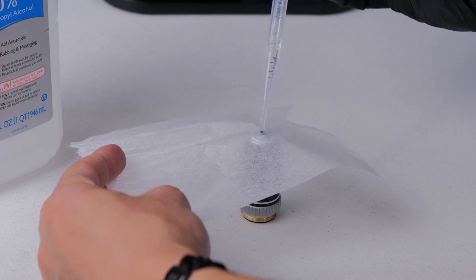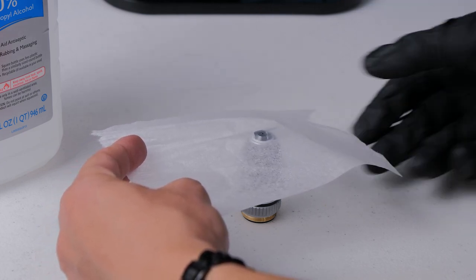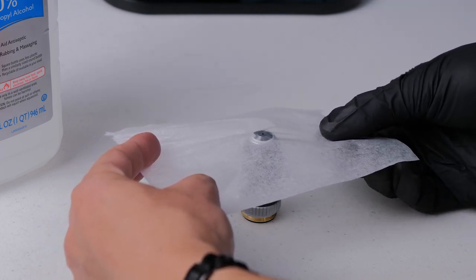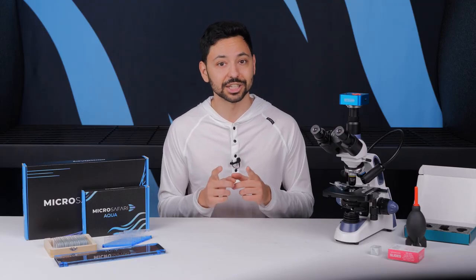Once you're done you'll need to clean off all the oil from your objective before it dries, ideally within about an hour or two. You'll see instructions on this during the cleaning section later in the video.